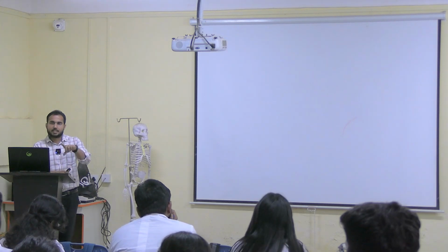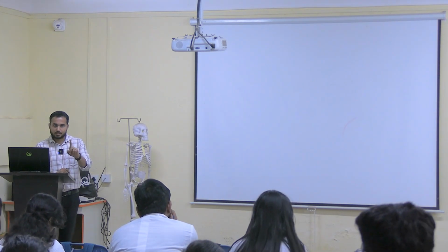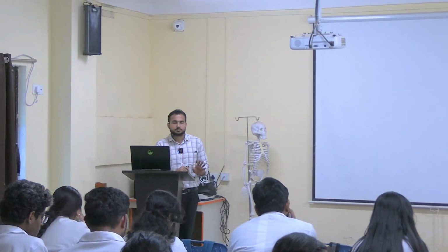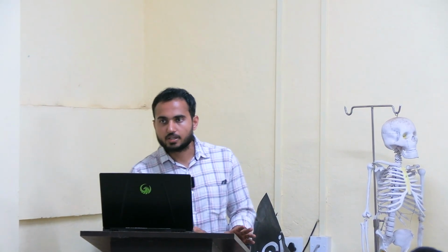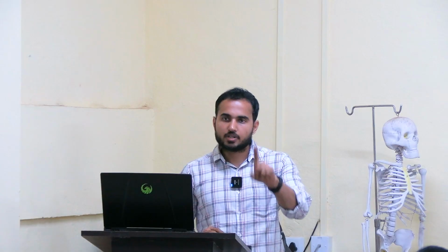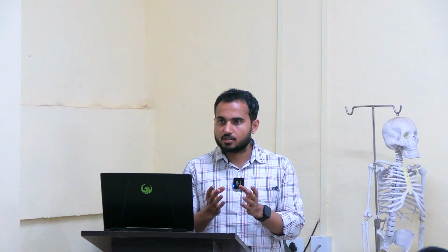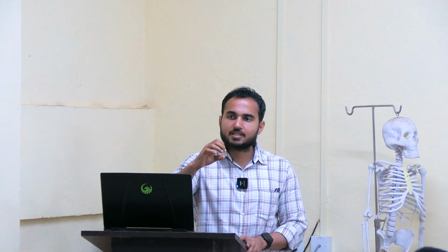So you have to understand one thing. When it is multiple, it is called acini. If it is one, it is called an acinus. Next, from the acini, take one particular acinus. It is a type of gland where a small lumen is present, circular in section.